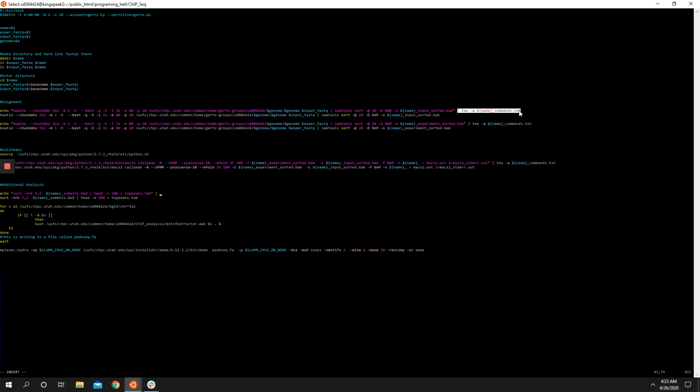Stupid thing, copy and paste. Lordy, I don't understand what's going on with my copy and paste here. Alright, there we go.